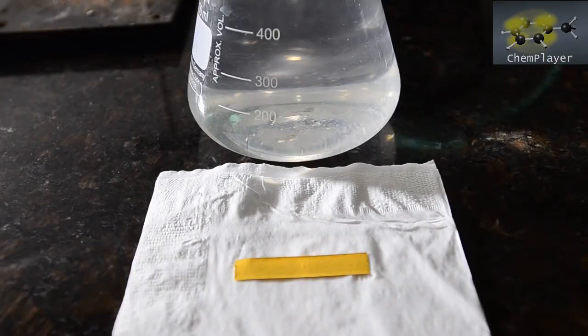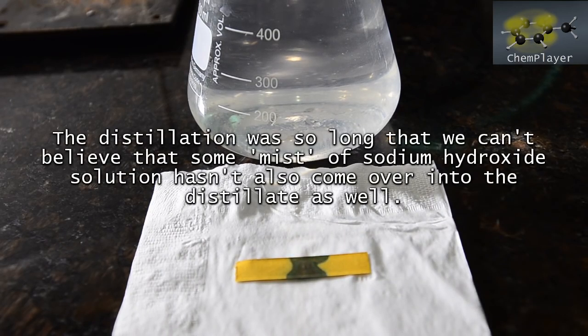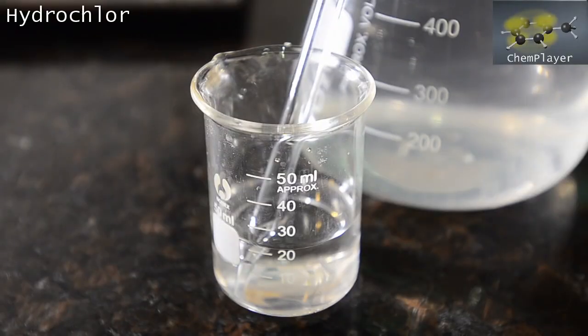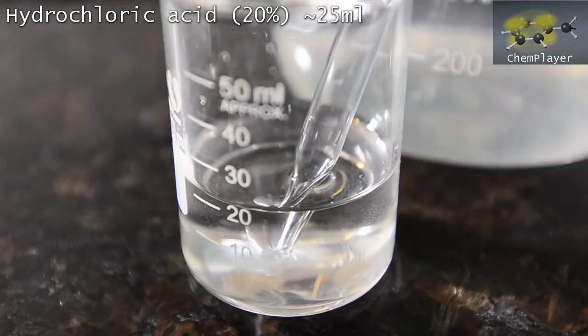Let's check the pH of the solution. Strongly alkaline, as we would expect. There may also be some sodium hydroxide that made it over in the mist from distilling. We've got about 25 ml of 20% hydrochloric acid here. We're going to use this to convert all the piperidine into the hydrochloride salt in the solution.